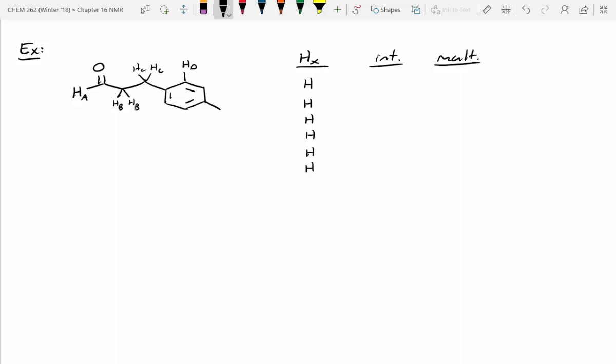Yeah, on the other half of the aromatic ring. Because we know that this aromatic ring has a plane of symmetry, and this upper group can actually flop around in space. Oops, sorry, these should be both HDs. So both HDs technically occupy that same chemical environment. Then down here we've got HE, and that must be equivalent to down here, which is HE. And then we also have all 3 of these protons, so I'll call these HF, HF, HF. So I've got A, B, C, D, E, and F.